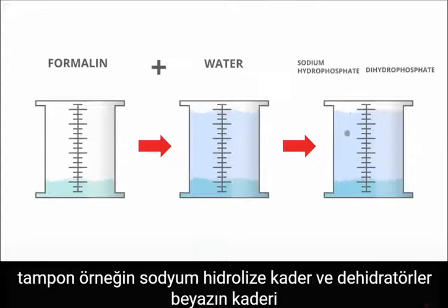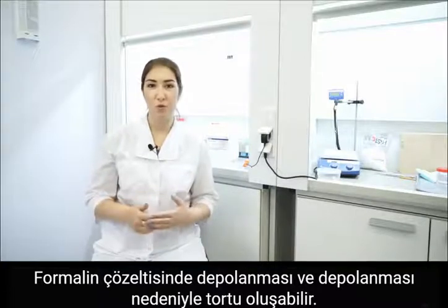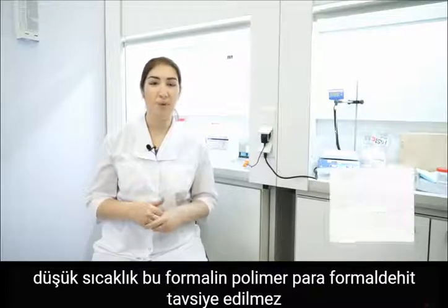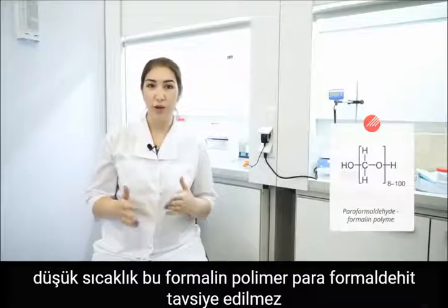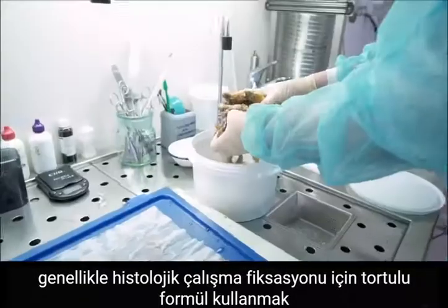sodium hydrophosphate and dihydrophosphate. The white sediment can be formed in formalin solution because of the storage at the low temperature. This is formalin polymer, paraformaldehyde. It is not recommended to use formalin with sediment for histological study.